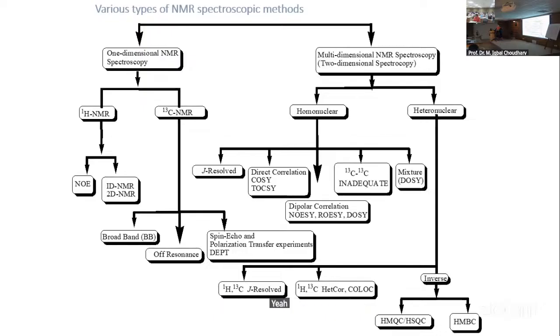Concentration, how can the concentration affect? If I use, for example, a simple compound like ethanol, what should I see? The big difference is whether you have at least the minimum concentration required for different types of experiments.